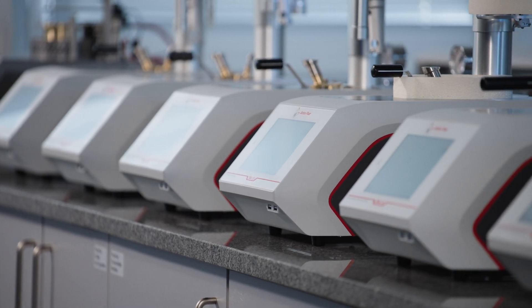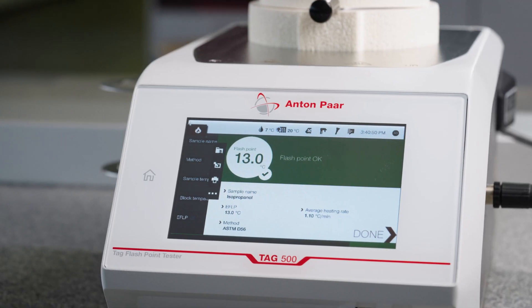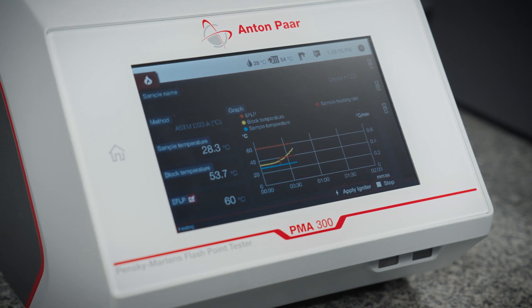Anton Paar's market-leading flashpoint testers help you meet the strictest requirements, decrease your operational costs, and facilitate top-of-the-line data handling.